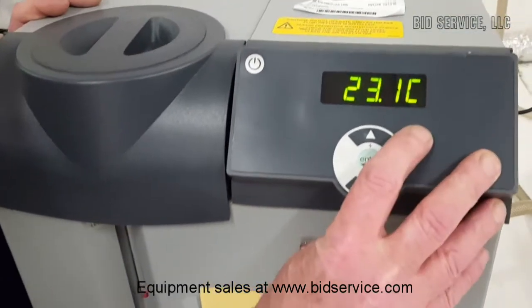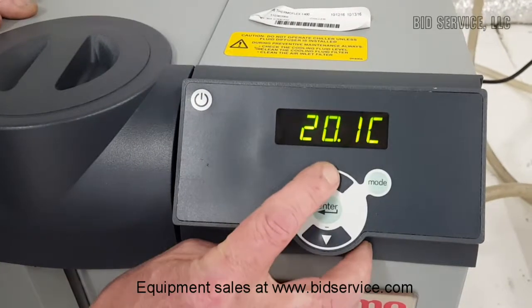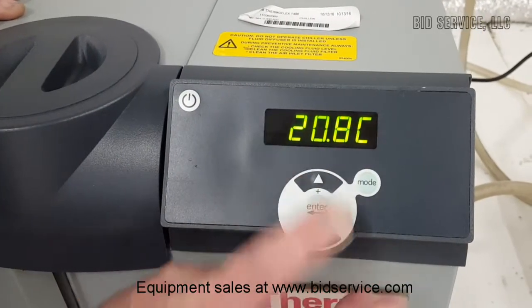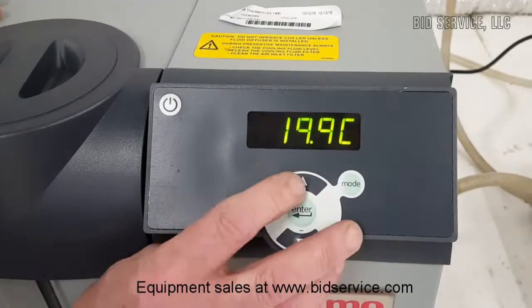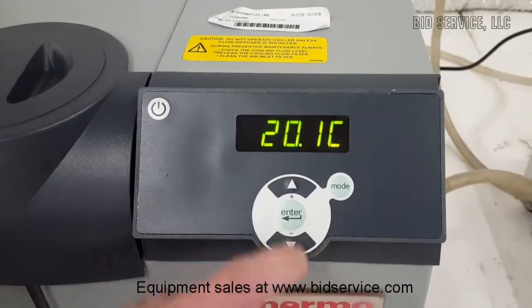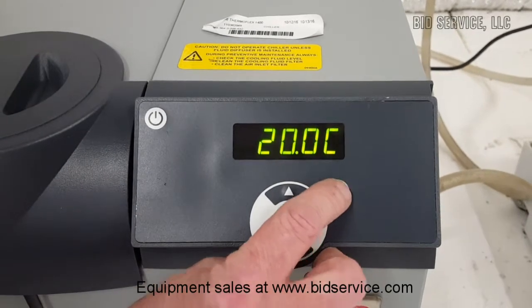You can change the set point by pushing the mode button once. You can raise it or lower it. For now, we're going to leave it at room temperature, 20 degrees C, and push that again.